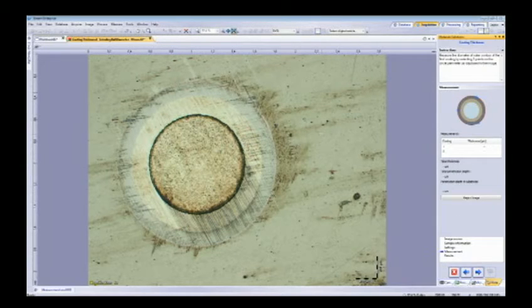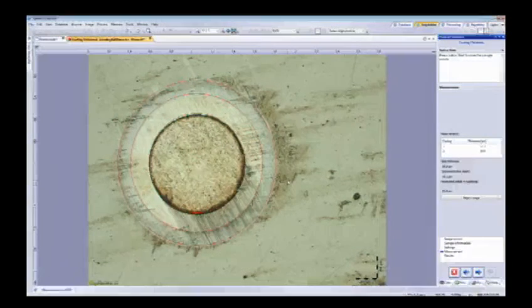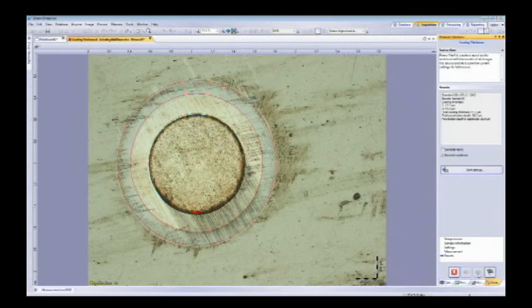And then it's going to physically ask us to mark the first outer layer. So we'll mark 3 points around that outer layer. And then we can move ourselves into the inner layer and then the last bottom base layer. And once we mark those 3 points, which is 2 layers, it'll give us our coating thickness over here. Again, if you had 100 samples, you could quickly go through these and get an idea. If it was a reject, you could just reject it out of the process. We just hit next to get our results.